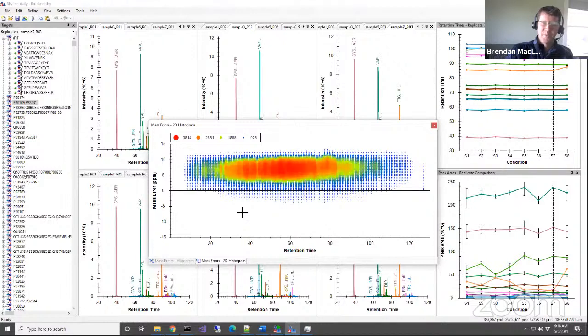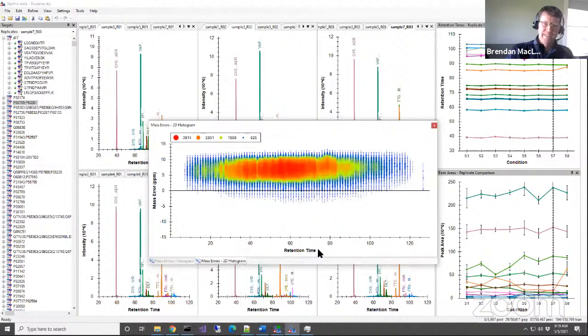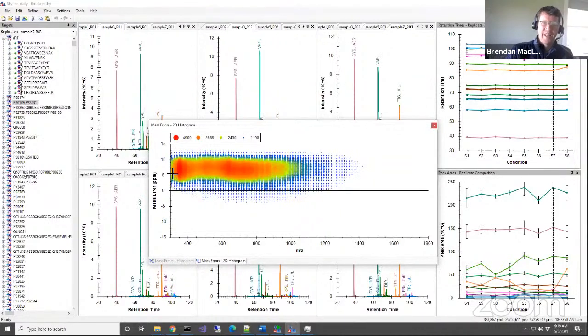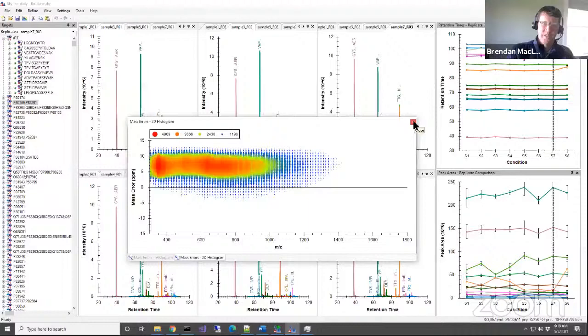The other dimension that we might be interested in checking, there's nothing up here over the retention times. It's pretty stably the same distribution we were seeing. But we might want to change the x-axis to mass to charge, and that would tell us there's not really any sort of curvature here. Really, this mass spectrometer was just poorly calibrated, off by about 6 ppm. So it's definitely interesting and useful information to always check that.